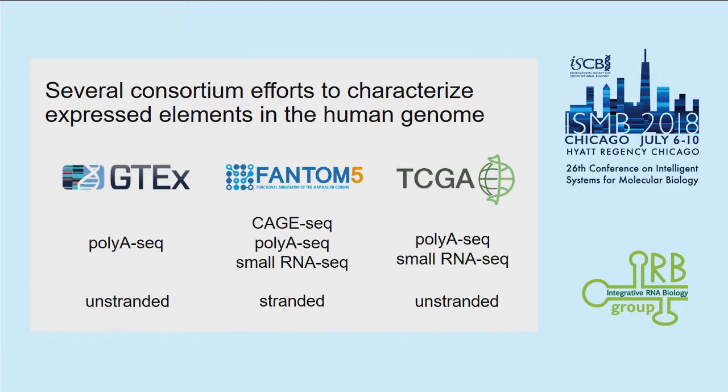For instance, all of them focus mainly on polyA-selected libraries, while only some of them include complementary library preparations like small RNA, and most of them include only unstranded data.